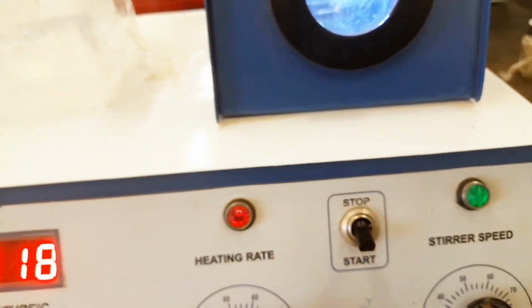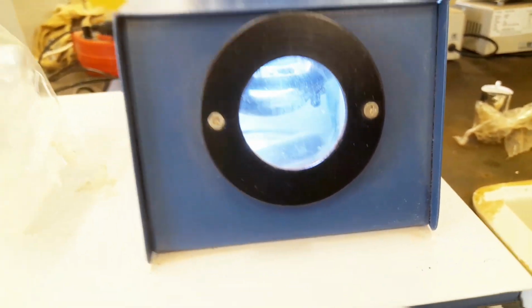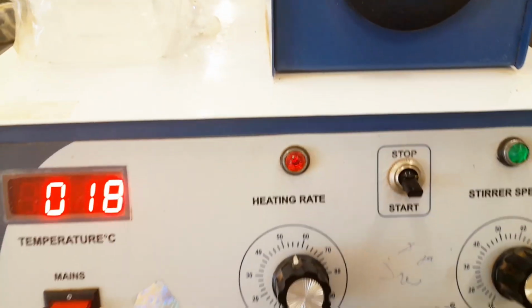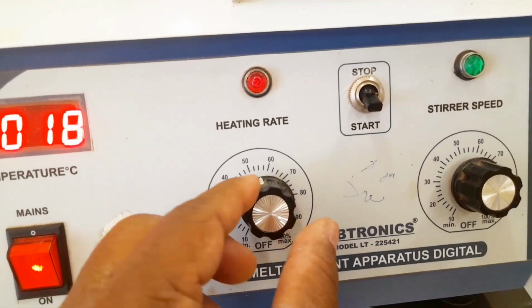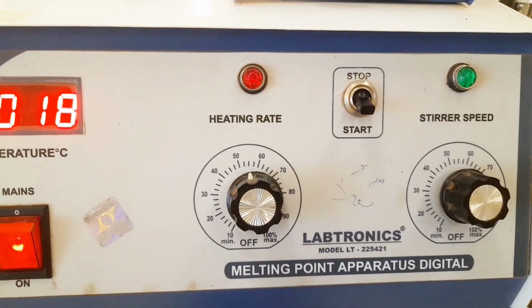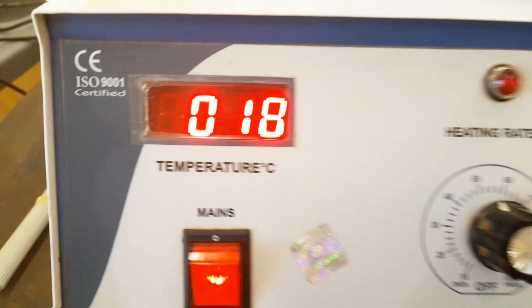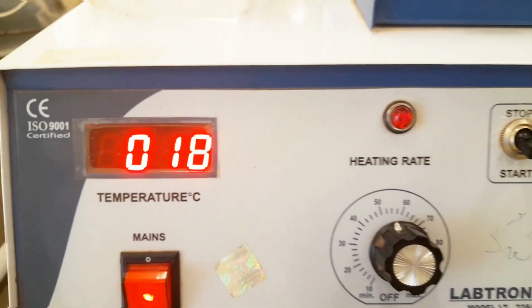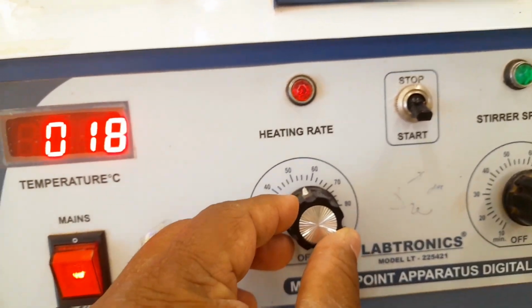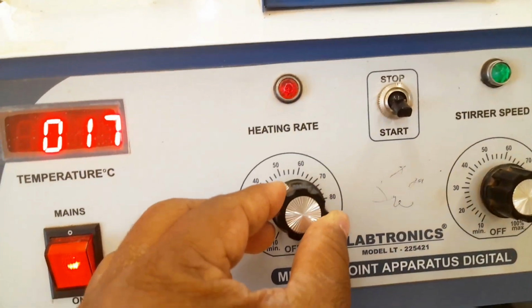Now how to identify the temperature change when it is converted from solid to liquid: there is a temperature heat rate arrangement. We have to arrange this one. Now it is between 50 and 60. So when the process starts, the temperature rises, and you can see the temperature here, it reaches 90, 95, 100 like that. Once it reaches 100 degrees centigrade, then we have to be careful, observing from this window whether the sample is converting into liquid form or not. Then we have to arrange this heating rate.